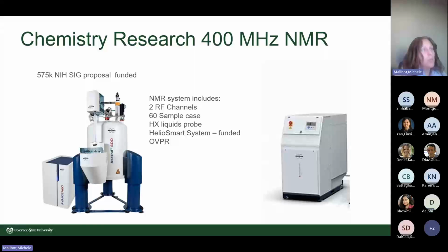It's the helium recovery system. It recovers the gaseous helium that boils off from the magnets, and takes it to high pressure cylinders, which we can connect to our current recovery system and liquefy to liquid helium. This is really helpful to keep our footprint of liquid helium down. It's a non-renewable resource.